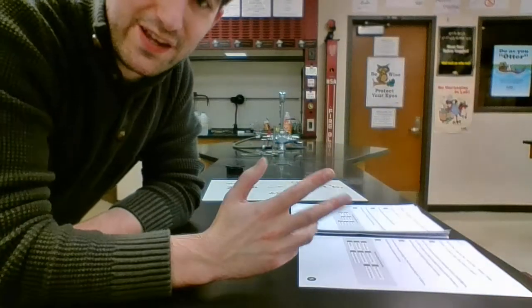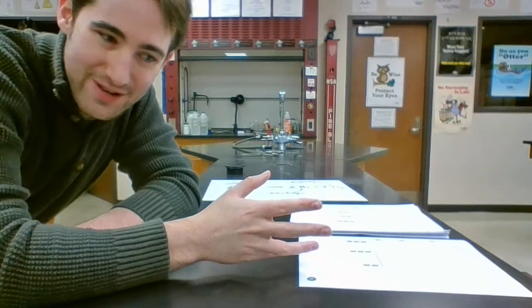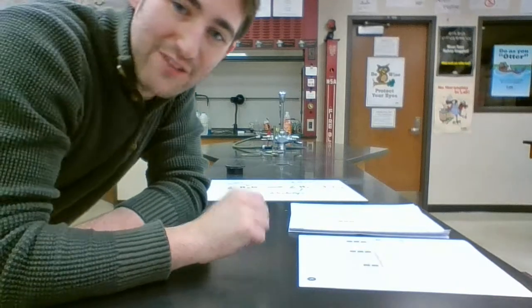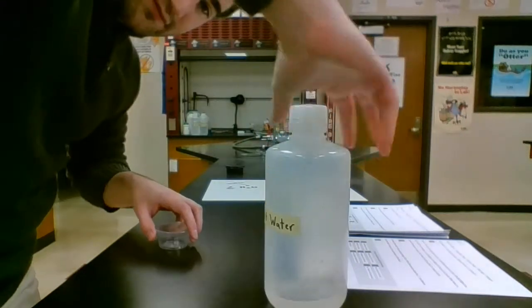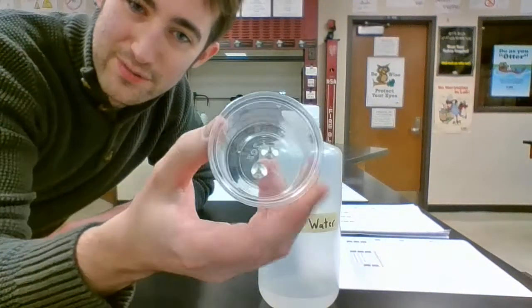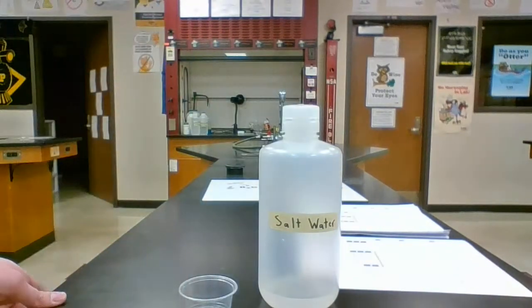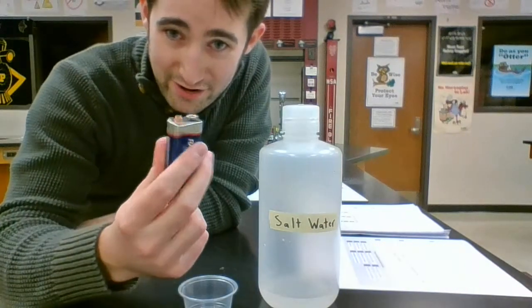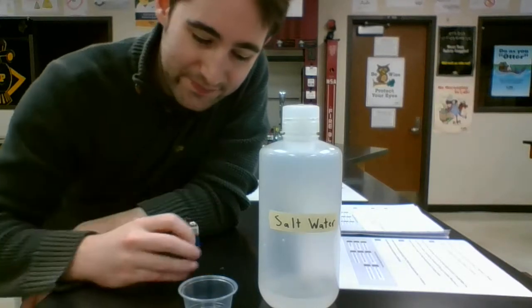Now, like the combustion model, we want to be able to see this in the lab so that we can tell it is an actual chemical change and look for the clues. So let's try it out. I've got some salt water here, and a little cup with tacks on the bottom of it. I also have a battery. This is kind of like the striker in this case. What's going to give us that little bit of kick to get the reaction going.